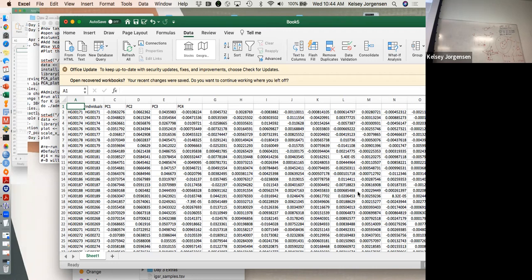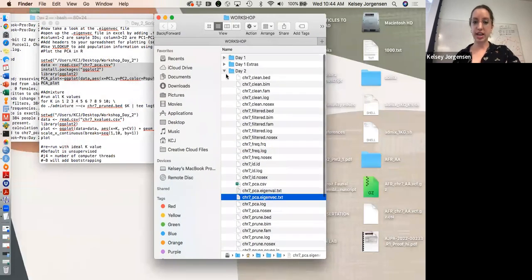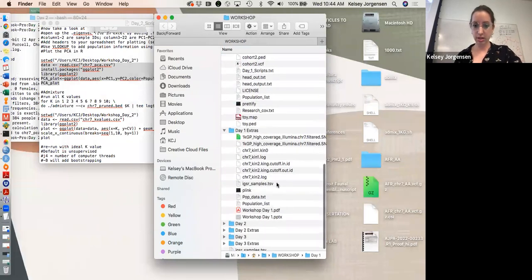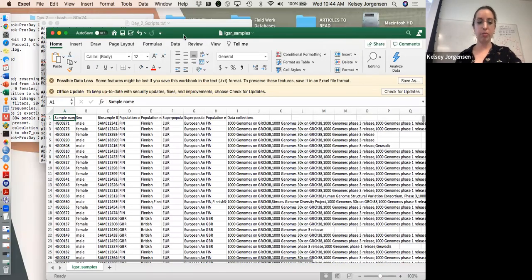Okay, so then you're going to find this table from yesterday, the TSB. Yes, exactly. Oh, okay, this one. Do we drag it? Yeah, I just drag it. I mean, you can open it however you like.